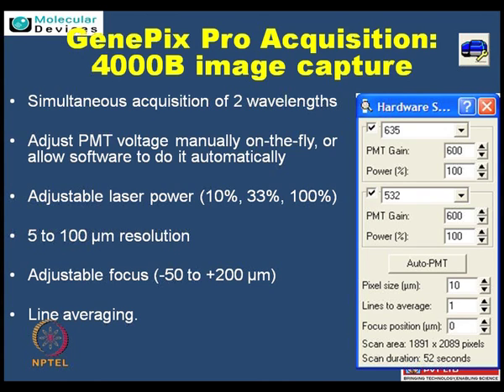So these are within the same software. Towards the right hand side you see the pane where you have a hardware control button. There you can also look at all these different images which are now suiting your own biological applications. I think it will be more clear when we are actually looking at your software interface. Sure.